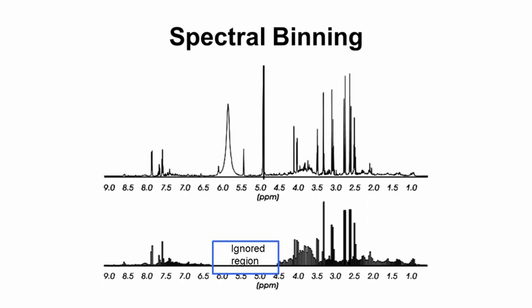So this is an example where we've essentially binned a spectrum on above, which is shown below. And basically you can see that the bins generally correspond to peaks. Some areas you can see where, especially around 3.5 to 4, the bins seem to be quite a bit bigger than the peaks. In other cases, peaks seem to be quite a bit smaller than the bins. And this is just simply a consequence of the resolution loss. But in essence, what's happened is we converted a spectrum that had 60 or 70,000 points to a spectrum that maybe has 100 bins. So that makes it a whole lot simpler.